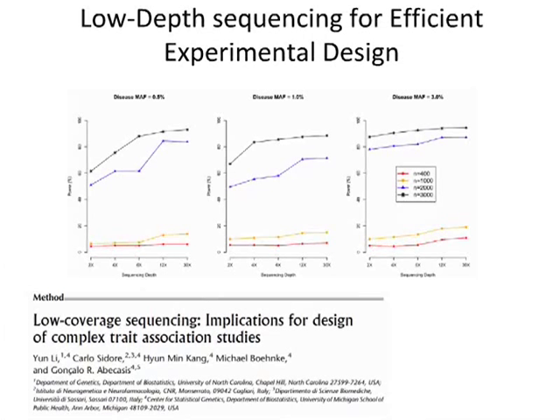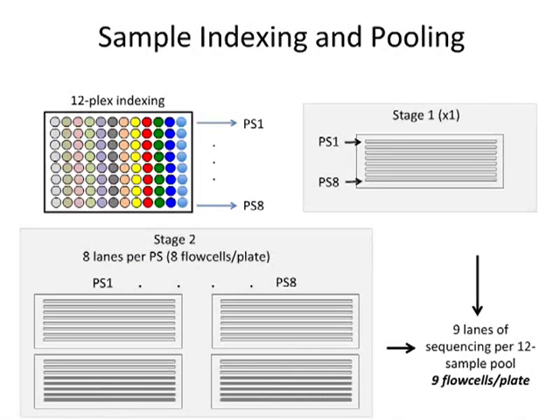And so again, I refer you to the paper for more details, and I only use this as an introduction to how we are proceeding forward with a 4,000 sample whole genome sequencing project. Obviously with that number of samples, very high consistency in library preparation and handling is very, very important. And then sequencing at low to moderate depth, about 12x coverage per sample.